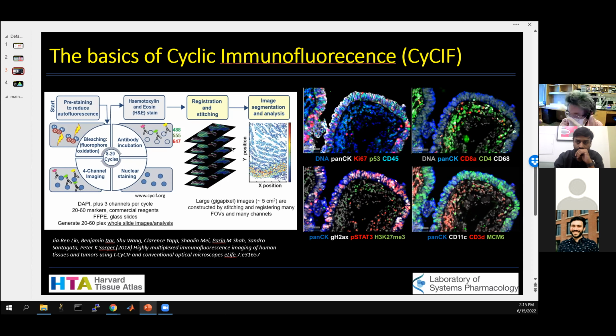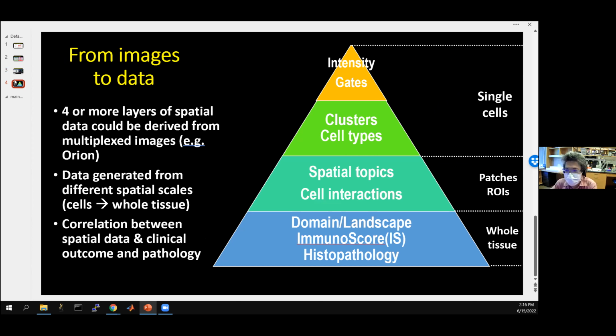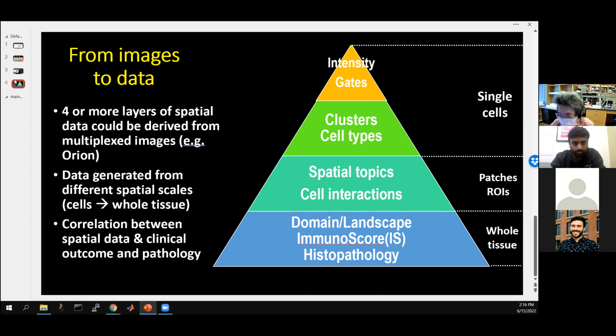I think there are a lot of developments in terms of the computational approach, the image processing approach, to get your final data. So for myself, I like this kind of approach, although it's because we've been working on it for years, but also in a way you can have a direct appreciation of what your data look like, right? You see this image, you understand your data, but it's more convoluted if you do a transcription approach. So I will start right here. In a way, it's more a perspective and more a discussion point for the other methods as well.